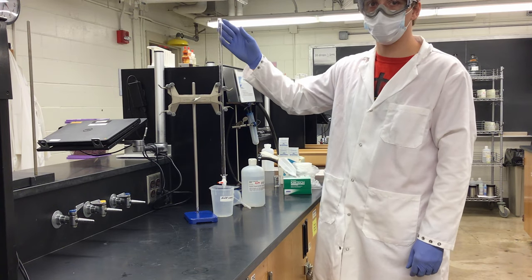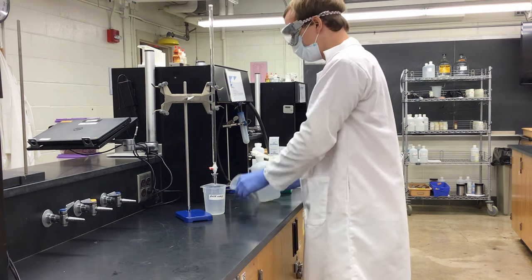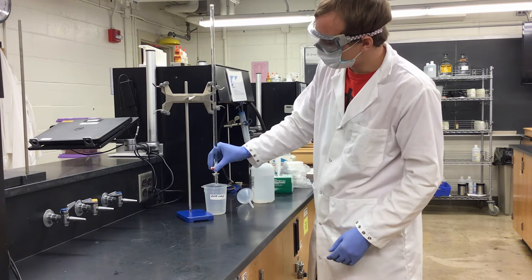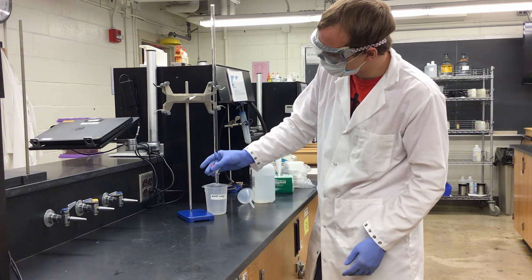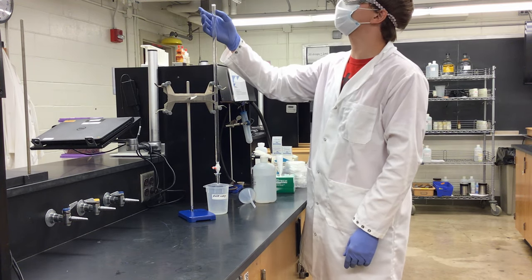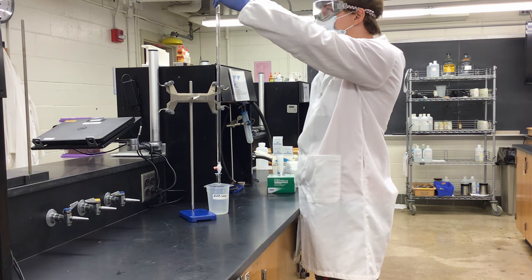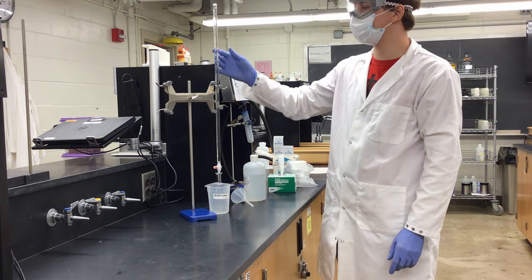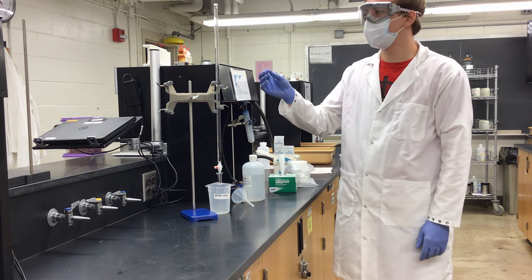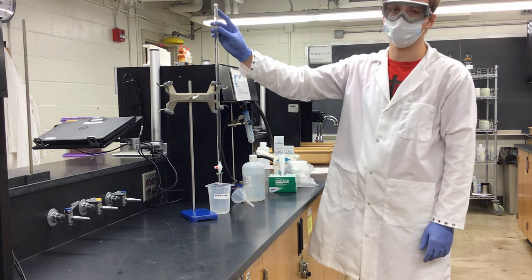Next I will fill my burette, get the bubbles out from both the tip and the burette, and then I am ready to titrate. Now that my burette is filled to the zero mark, I'm removing air bubbles from my tip by opening the stopcock and letting some titrant flow through until all the air is out. Since I've used some titrant I'll refill to the zero mark, then wait for air bubbles created while pouring to gather at the top before adjusting back to zero.